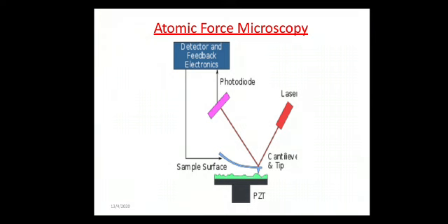And this atomic force microscope's probes cannot normally measure steep walls or overhangs. Cantilevers are more expensive, which we are using in these applications. Let's see the applications where we are using this atomic force microscopy. In nanotechnological analysis and biological research, we are using this atomic force microscopy.